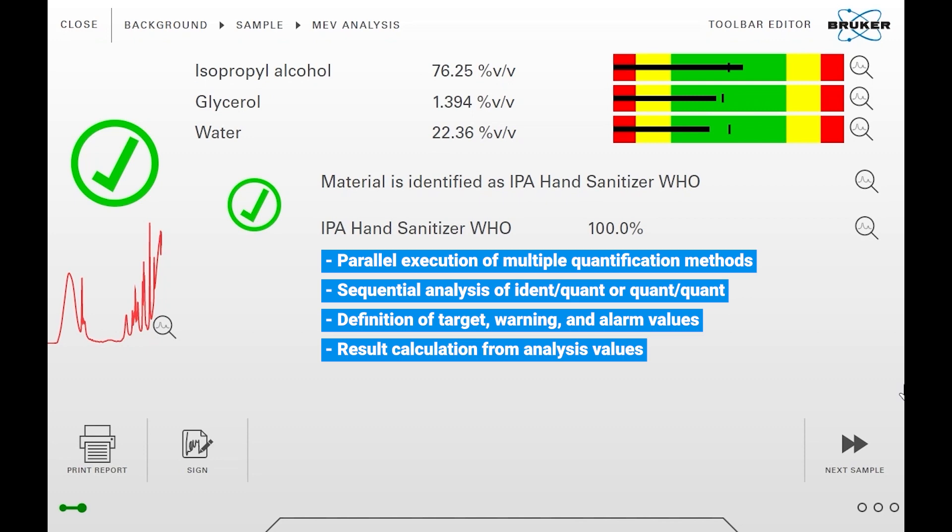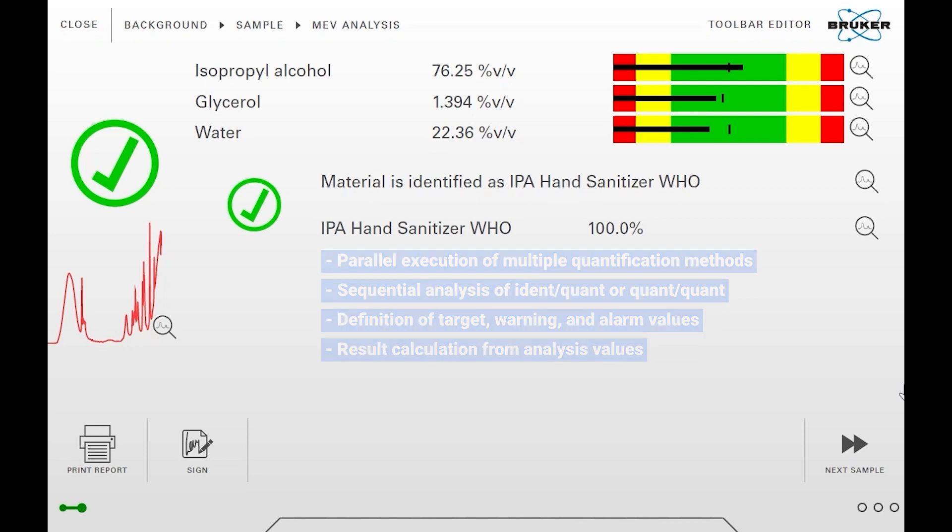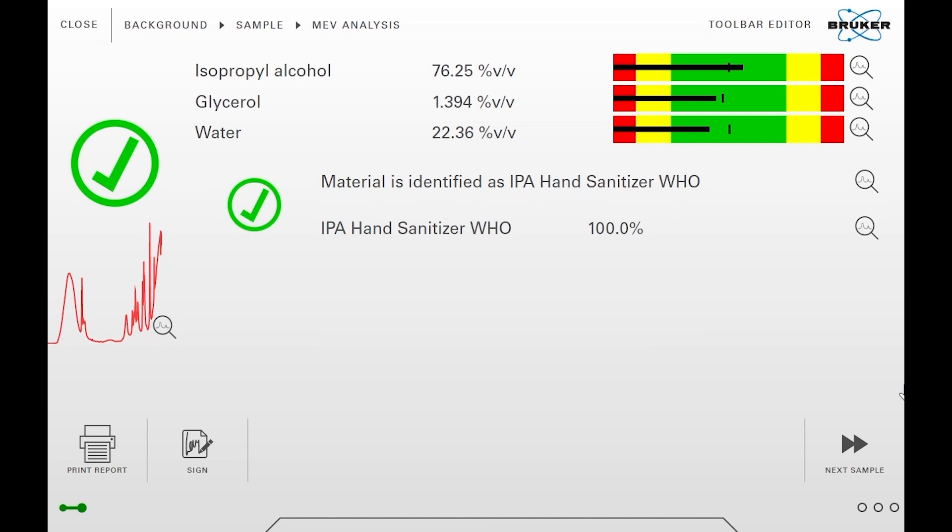You can define target, warning and alarm values and calculate the overall result from individual analysis parameters.